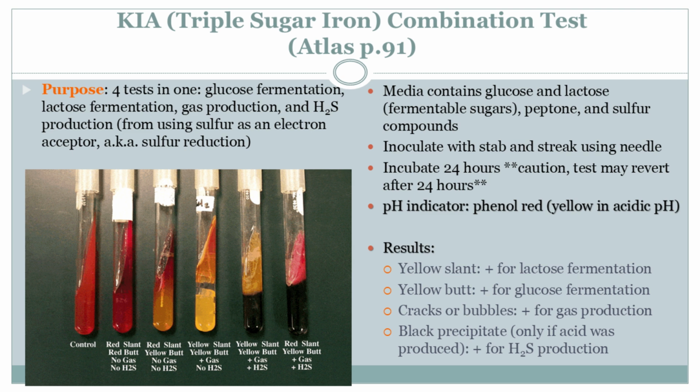This is kind of blowing my mind that this simple test is used for so many things. It's one of those fundamental microbiology techniques that has a lot of applications. We're really seeing how microbiology is behind the scenes. It is. In our lives in all these ways that we don't even think about. That's really cool. Okay. So we've got medicine, we've got food safety. Are there other ways that this is used, or is that kind of the main? Well, those are two of the big ones. But there are other applications too.